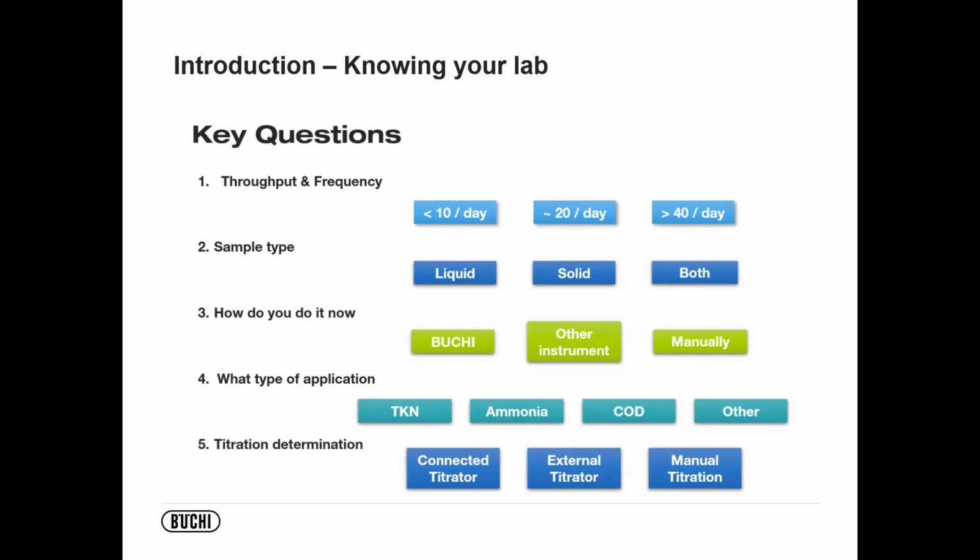The last key piece that's not really on here is the recordability and some of the compliance aspects. What level of compliance do you need to meet? How much data recording integration into your LIMS system do you need? How important is that today, or would that be important a year or two from now? So again, when you're looking into whether or not automated Kjeldahl or really any of this technology is a good fit, there needs to be a lot of self-reflection done beforehand to fully understand maybe what your capacity is.